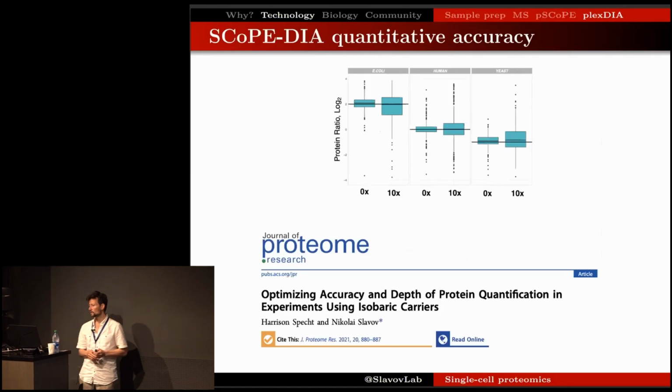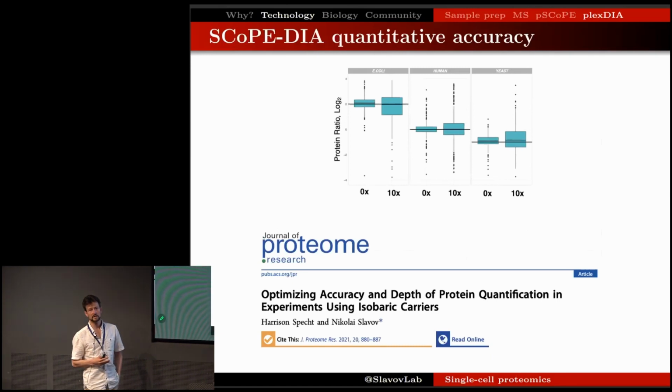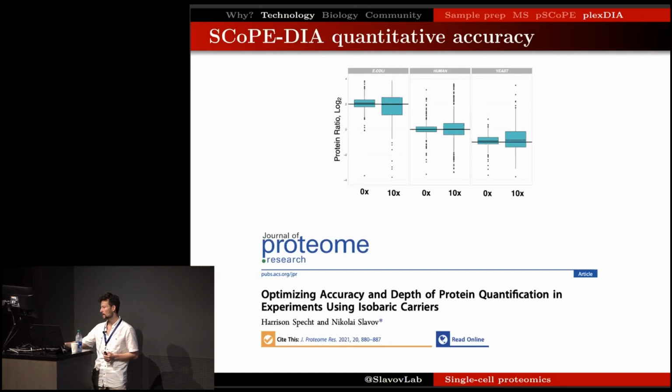And Luke is working on writing a paper that is going to share the details on that, and we are going to introduce what are the important guidelines and things to observe when using such carriers so that the accuracy is preserved. But in the meantime, before we have published that, I would just point out that many of the same considerations that we previously shared for using isobaric carriers apply in this case of using isotopologous carriers as well. And one has to be mindful that the windows are going to be wider for isotopologous carriers with DIA compared to what they are for DDA with isobaric carriers.